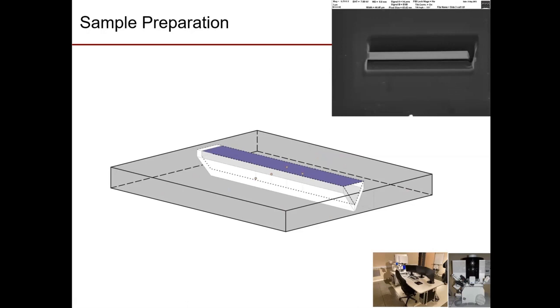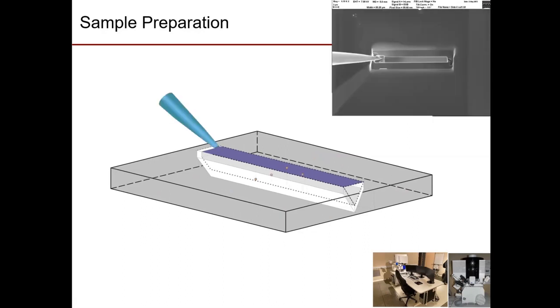We then free one end with a cross cut, producing a triangular cantilever, and bring in the micromanipulator probe that most modern FIBs are equipped with. We attach that to the free end of the cantilever using deposited material and cut the final end free, allowing us to lift out this triangular bar from its host substrate, containing undamaged features of interest on the inside.